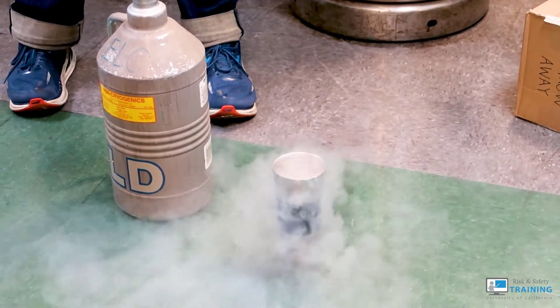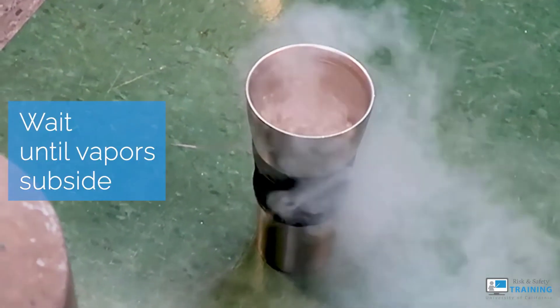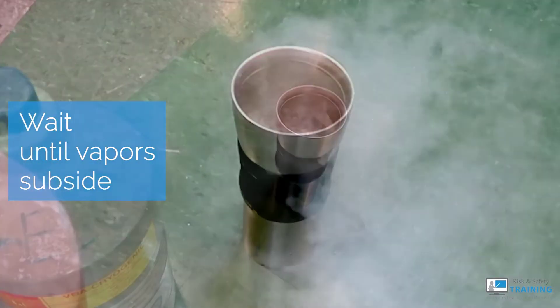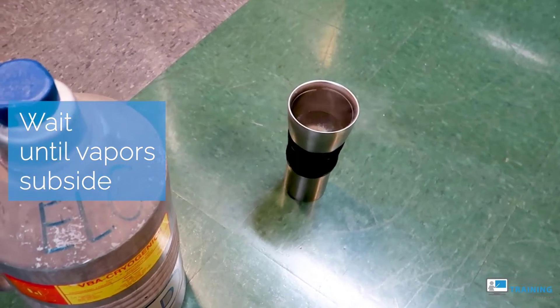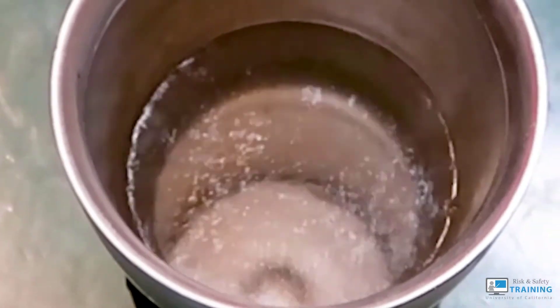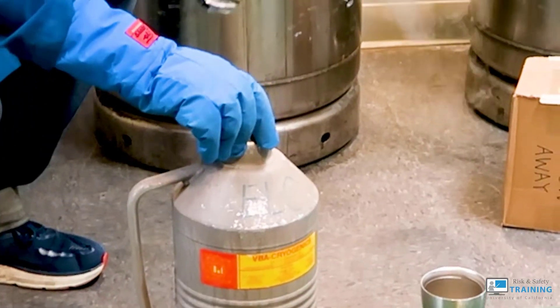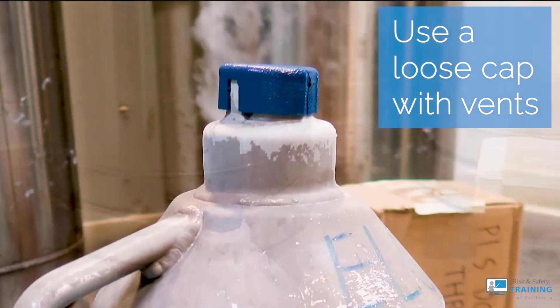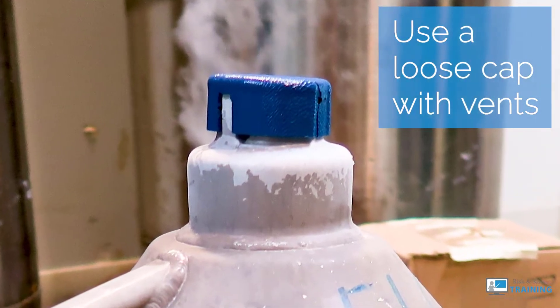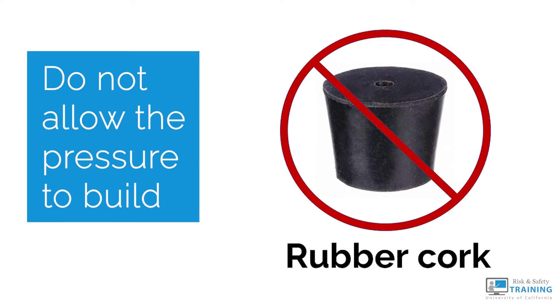In an open-mouthed container, you can see the liquid nitrogen react or bubble. Leave it in place until the container cools and the vapors subside. This is the reaction from the liquid rapidly cooling the warmer cylinder, often at room temperature. Once you can, put a cap on your small container. Make sure to use a loose cap with vents designed for pressure release. Do not use a rubber cork or anything solid that will pressurize the container inside.